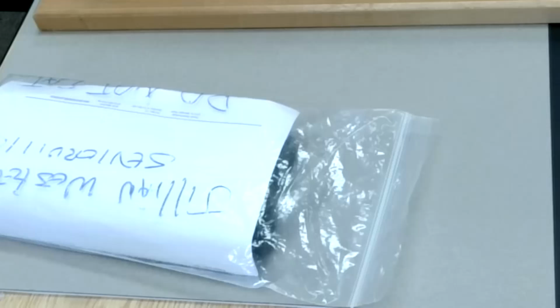So today we're going to take a look at a demonstration on diffusion and osmosis. We're going to take a look at the cells of the other tissue types, the muscles and connective tissue and nervous tissue. We're going to take a look at the skin. And if we have time, we'll take a look at the cheek cells. If not, we'll just push that back a week and do it next week. So we have some flexibility.